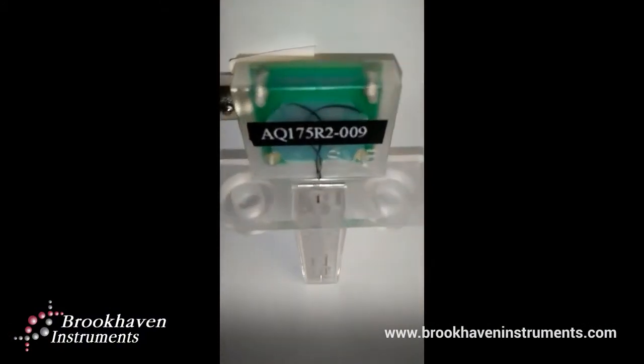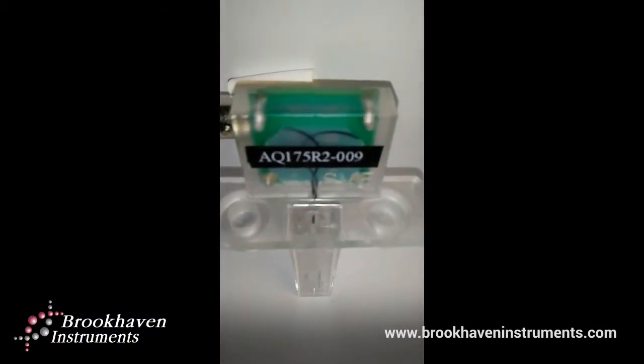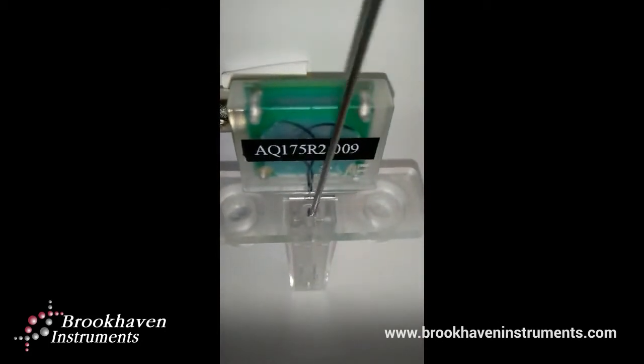Then, insert the cannula into the sample cell opening, as far as possible.